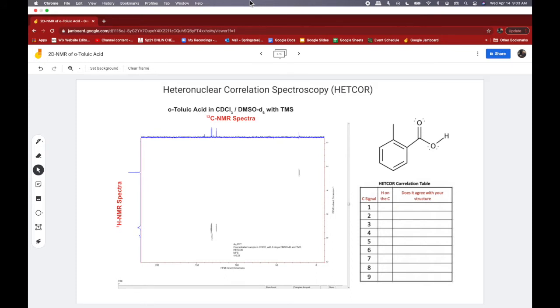So the first carbon signal, 1, the most downfield one, is the carbonyl signal, and that one is at about 170. And then we have a short signal 2. It's one of these ones that have no hydrogens. And then signals 3 through 5. And then 6 is another short one. It's one of those; so these are 2 and 6, if you remember. And then we have the aromatics. And then we have 8 way down here. So I'm going to make sure I use those same numbers for this labeling.